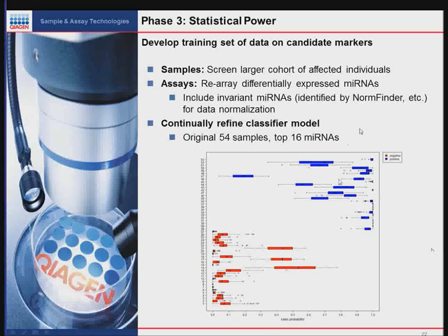positive patients, and there's maybe one that seems kind of suspiciously maybe not really that positive, but these cluster extremely nicely, and the normal controls also cluster extremely nicely. And there are a couple of overlaps here, and we're not quite sure whether these are misdiagnosed or not, or what they are. But in general, even miR-122 on its own classifies these samples extremely well.